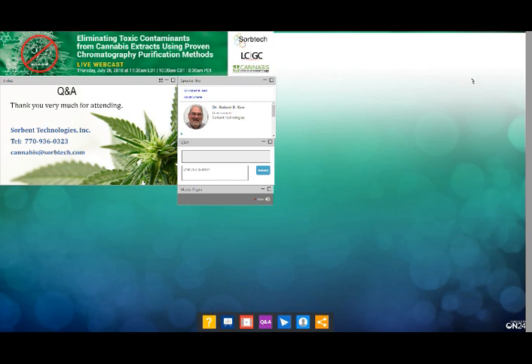And this, the fluorosil, is really just an adsorbent. So as long as it's got enough time to have some contact with the fluorosil, the contaminant is going to be absorbed. You don't want to pass it through too fast, because then, kinetically, it won't have time to be absorbed. So anyway, I think that's a good answer.